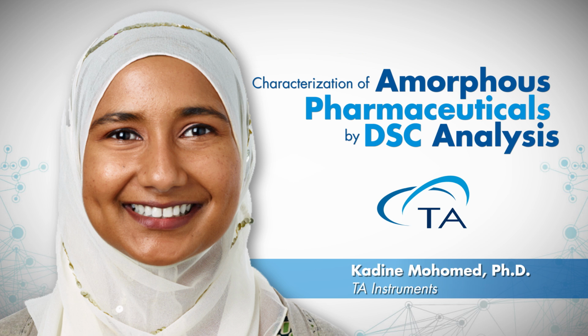So I would say that an approach would be to first run standard DSC. If you see a single Tg, you can begin to assume that it's miscible, but to truly confirm that, run modulated DSC as well.